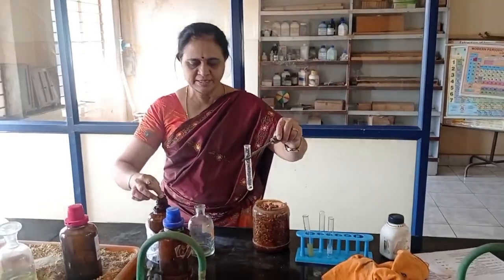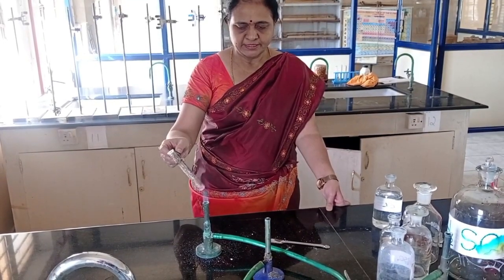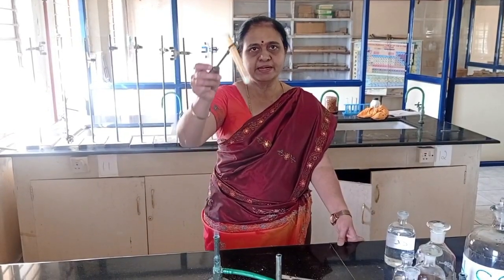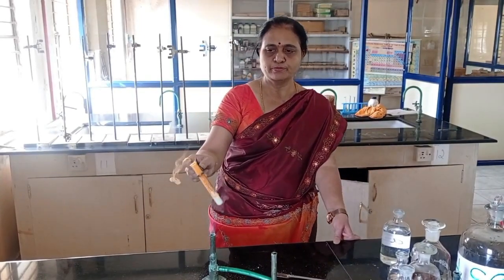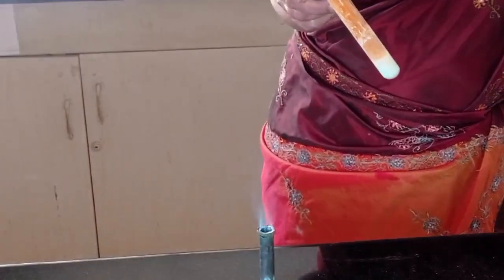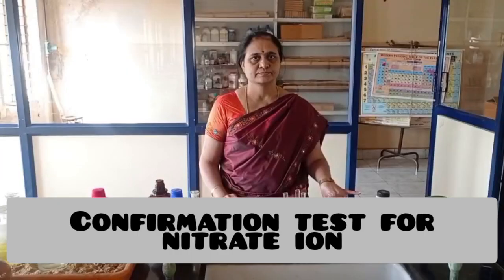So, I am heating the above test tube by adding copper turnings. Observe what happens. See here, on heating only I am getting reddish brown fumes. See how reddish brown fumes are evolved, after heating the test tube with copper turnings. So second group acid radical present, nitrate present.